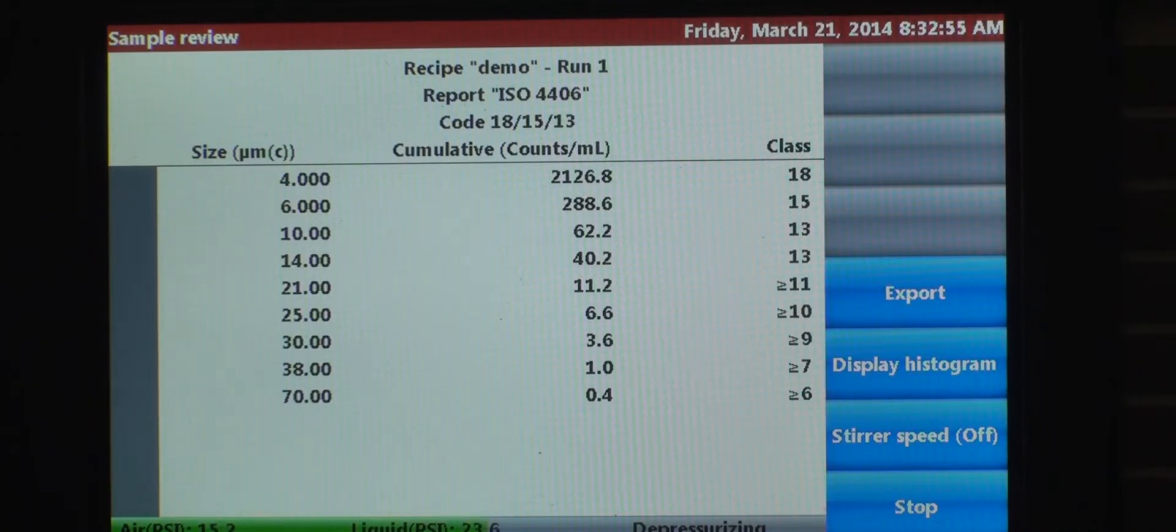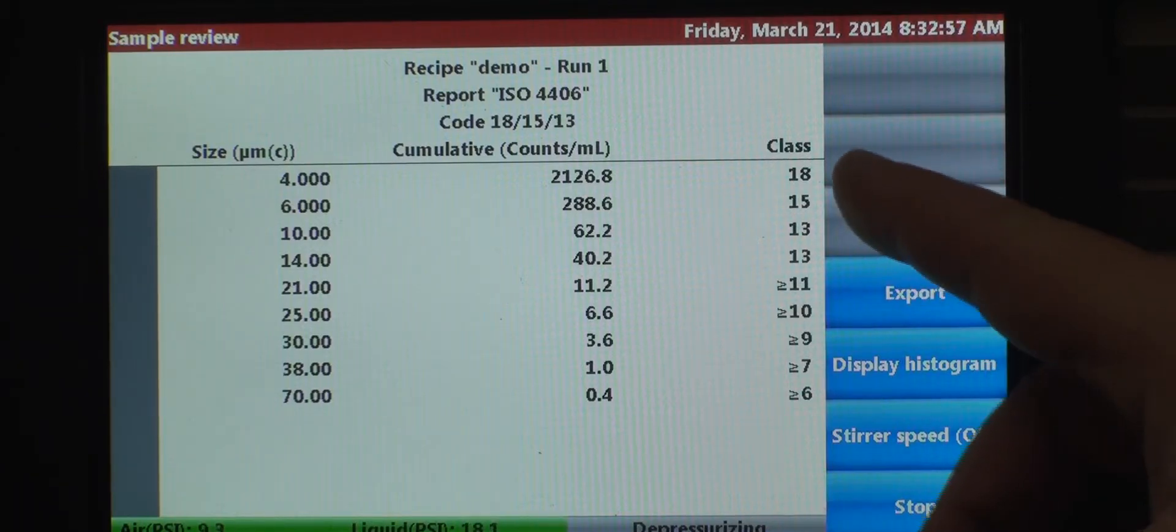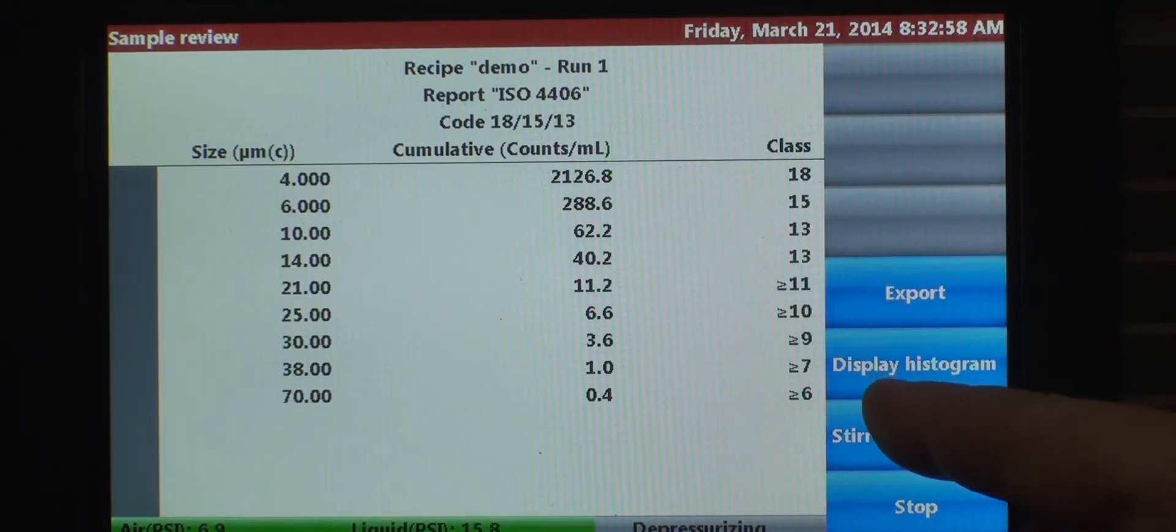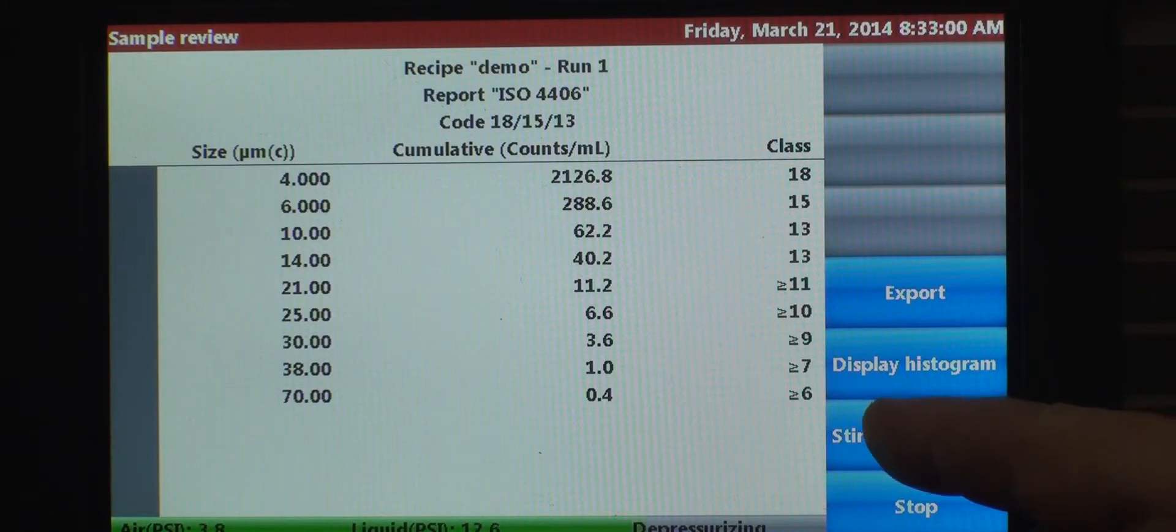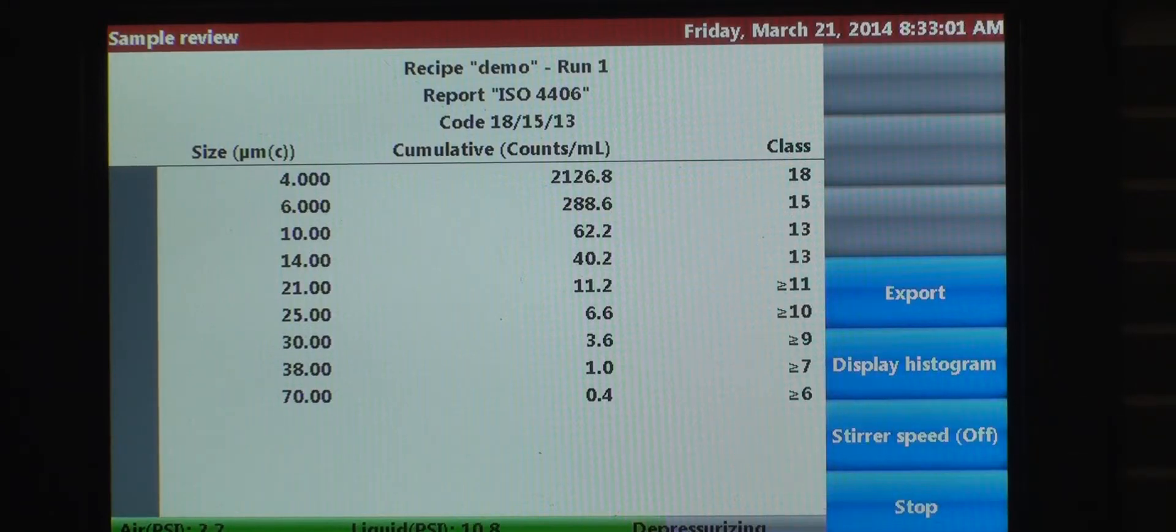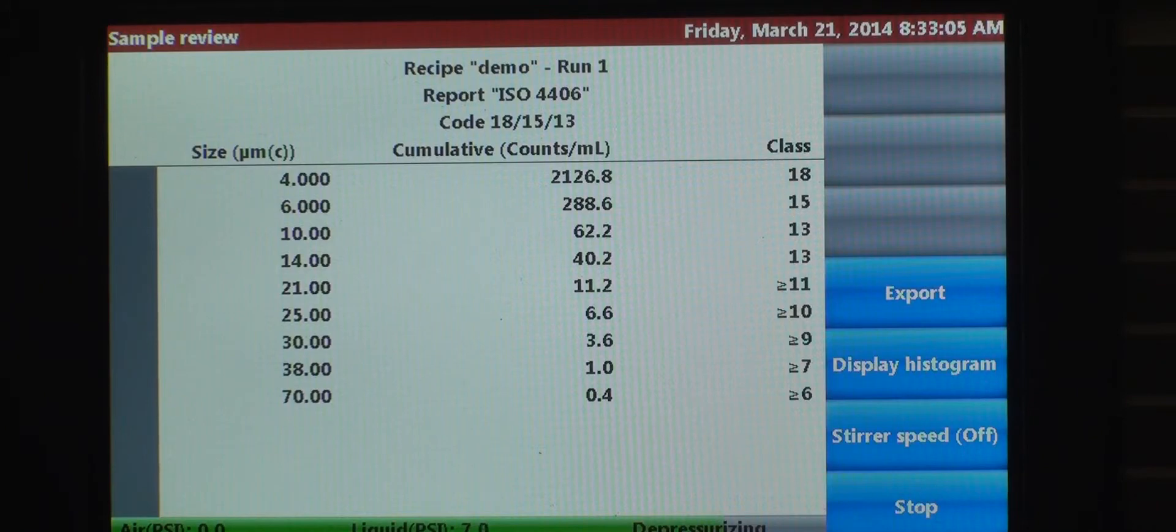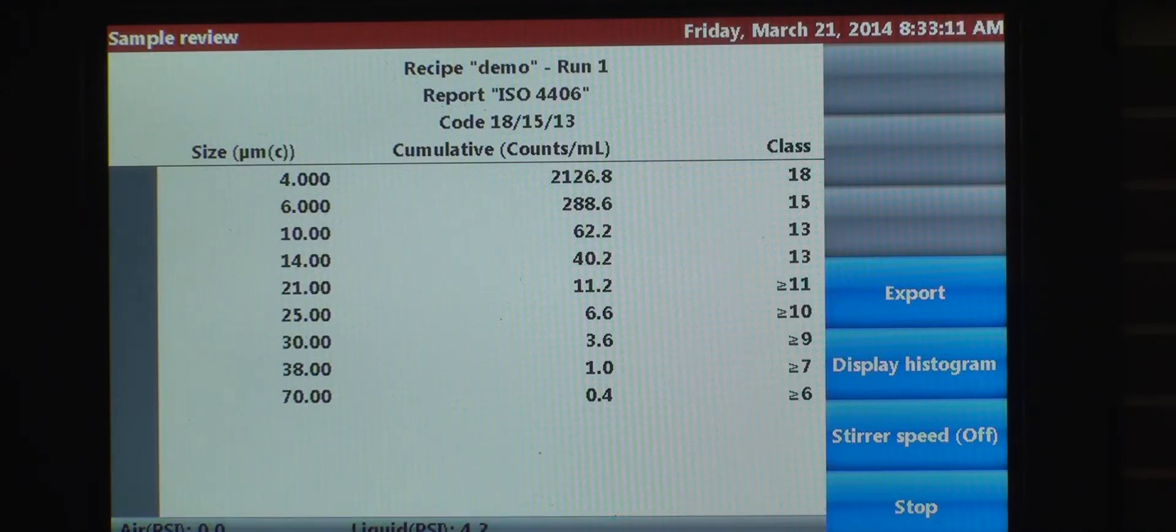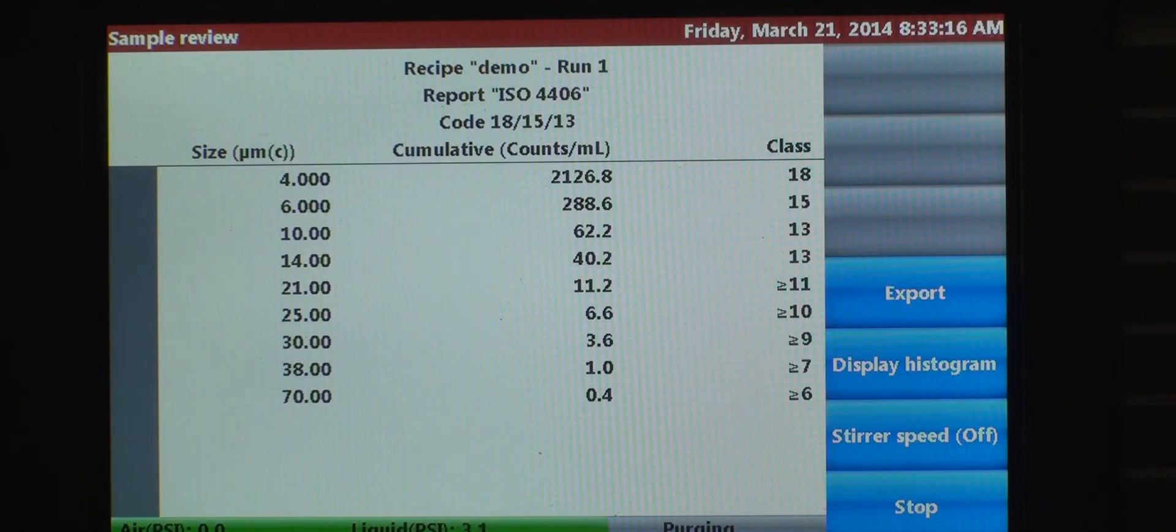The unit's depressurizing. We have our classes here for our ISO data. Now every time you want to run this sample, or every time you want to run this particular recipe, all you need to do is go through that final step where you select the recipe. You literally hit one button and you're sampling. It's a very fast process. So that's it for the 8011 Plus.